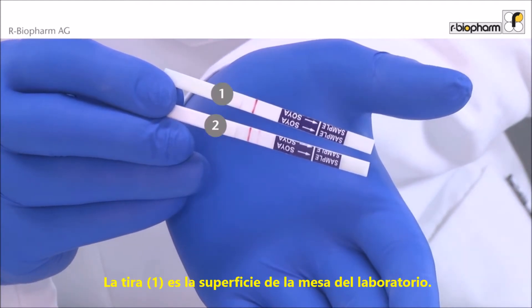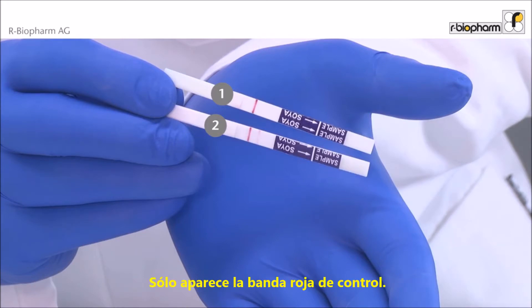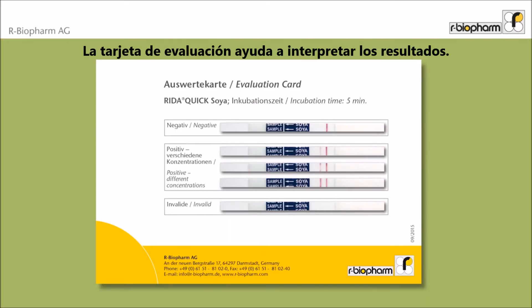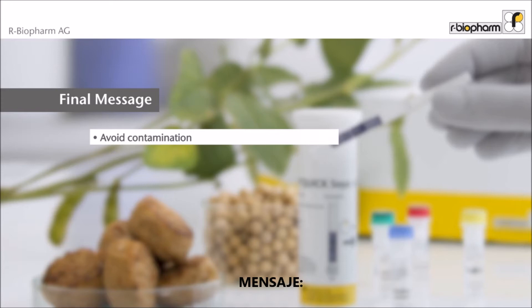The first dipstick is the swab from the surface of the lab bench — only the red control band is visible. The result is clearly negative. The second dipstick is the swab from the blender; it shows both red lines. The result is positive — the blender needs further cleaning. The evaluation card helps to read results.